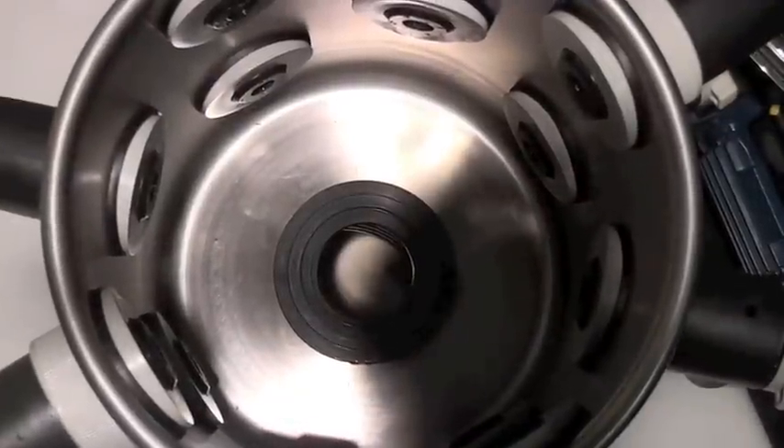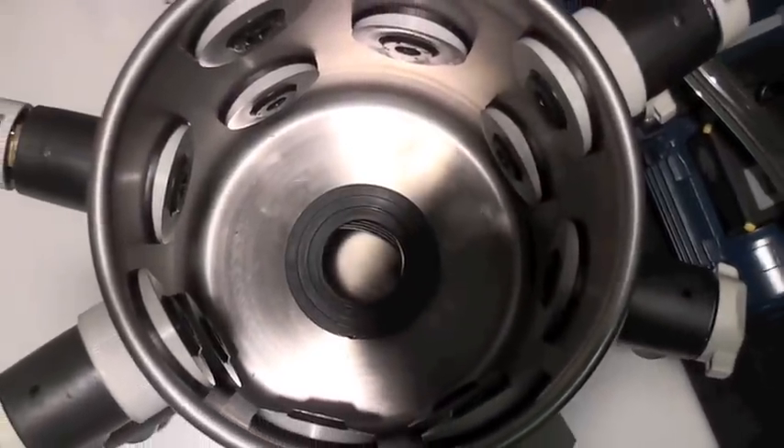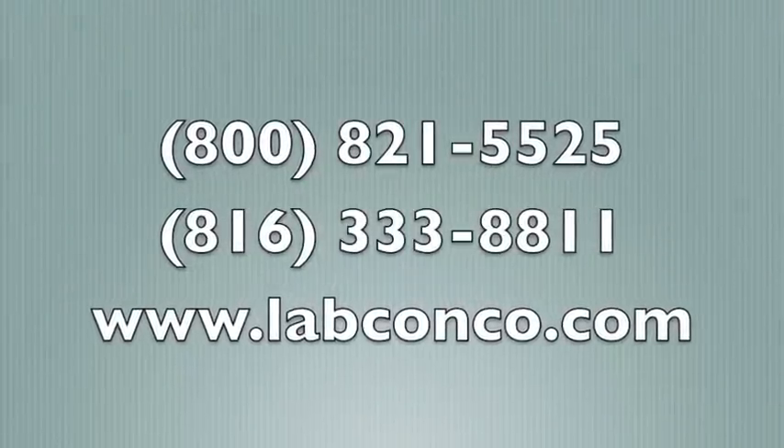Installation is complete and standard operation can begin. For more information, contact your LabConco representative.